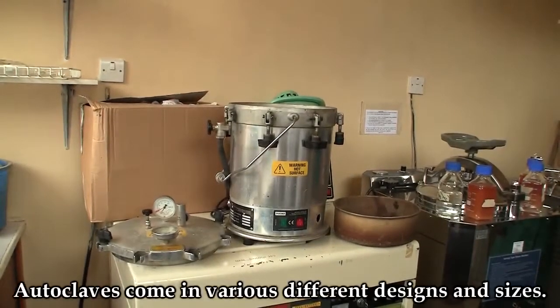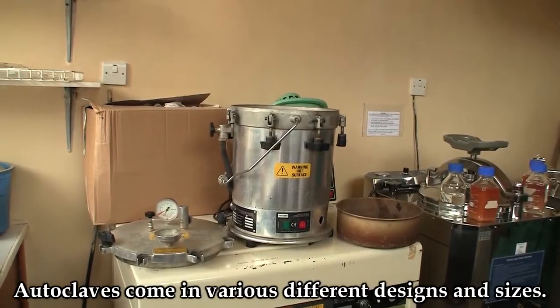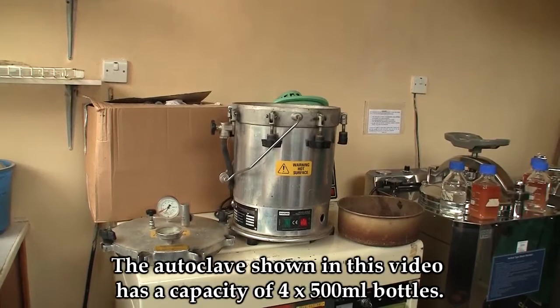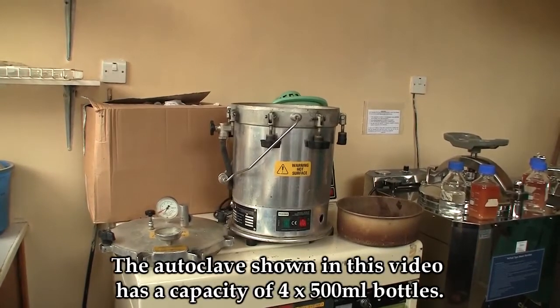Autoclaves come in different designs and sizes. The autoclave we are using today has a capacity of four 500ml bottles.